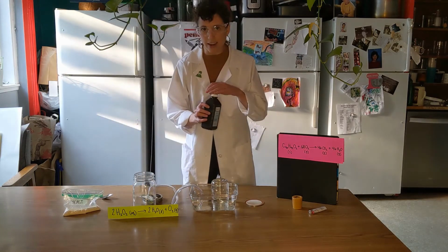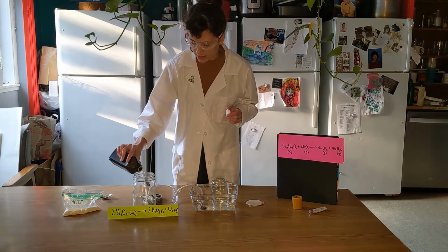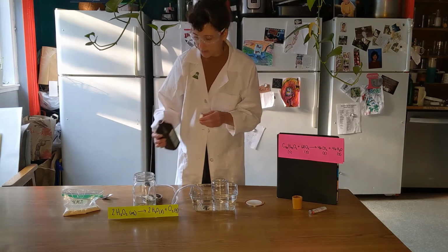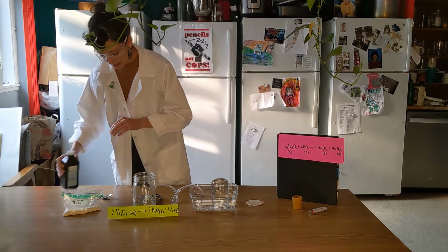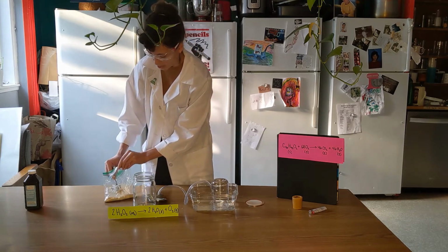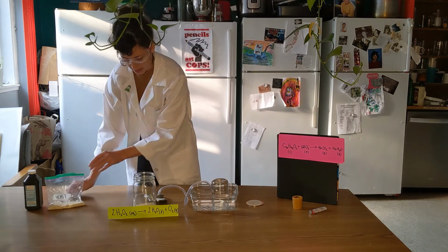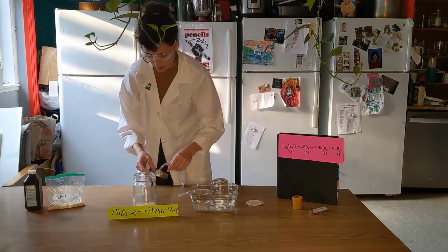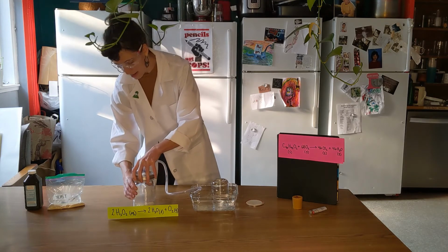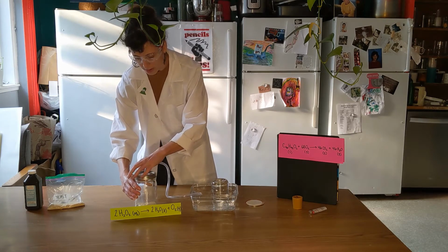So I'm not being very precise here. I'm just going to dump some hydrogen peroxide into my reaction vessel. And I'm going to put a spoonful of yeast in with the hydrogen peroxide. Close the vessel. Seal it nice and tight so that any gas that wants to escape has to go through the tube.